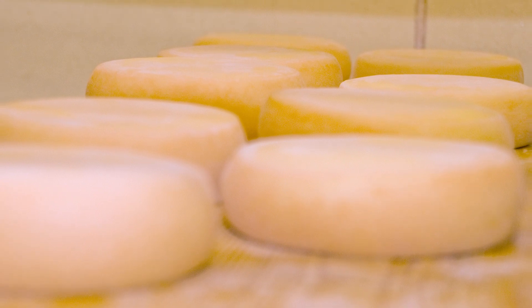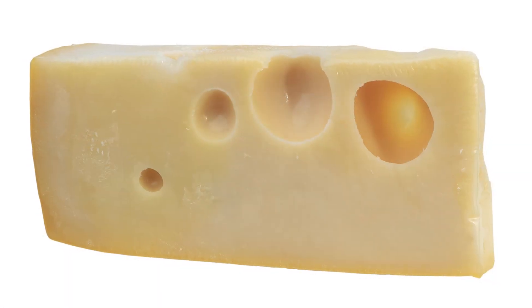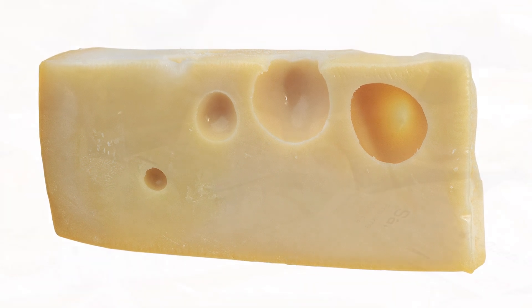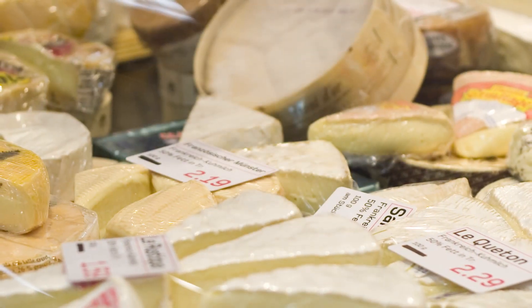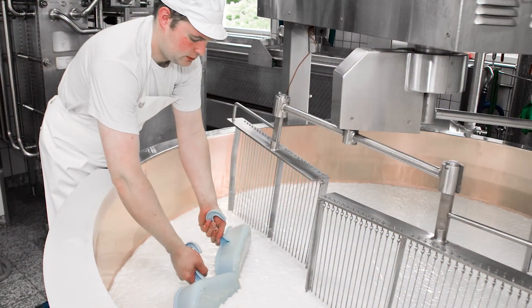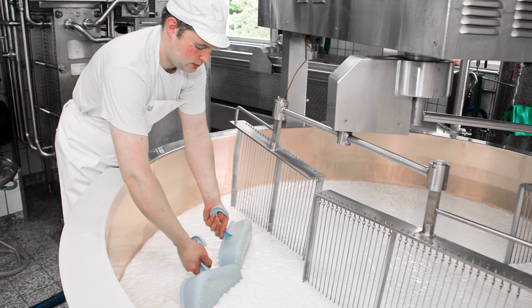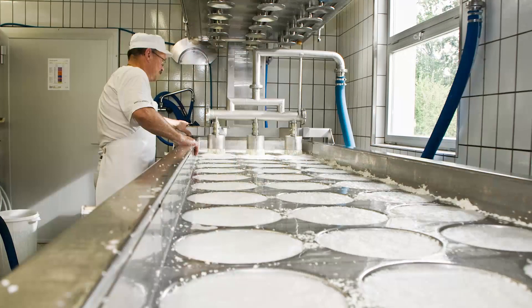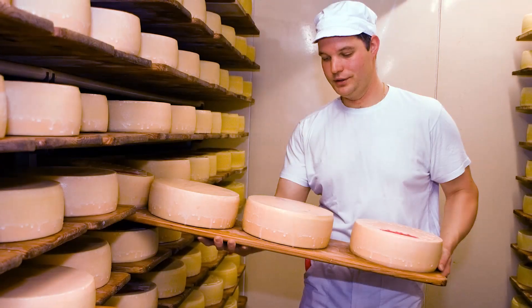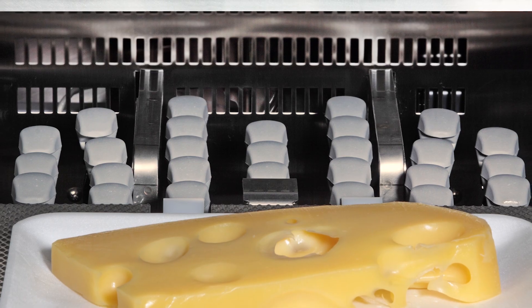Cheese is a popular dairy product valued for its high nutritional value, taste, and shelf stability. Depending upon the techniques of manufacturing and compositions, there are different varieties of cheese available. Measuring pH accurately at each stage of cheese manufacturing, such as acidification of milk, drainage of whey, milling, and salting, ensures the desired flavor and texture of the cheese.